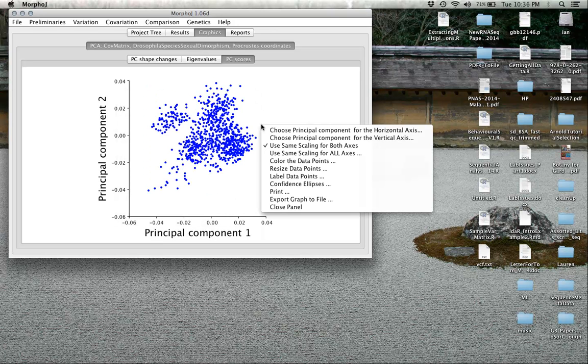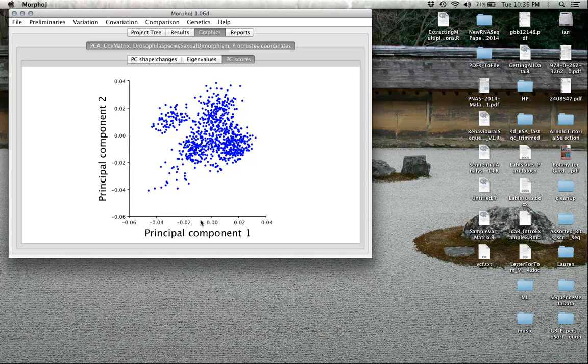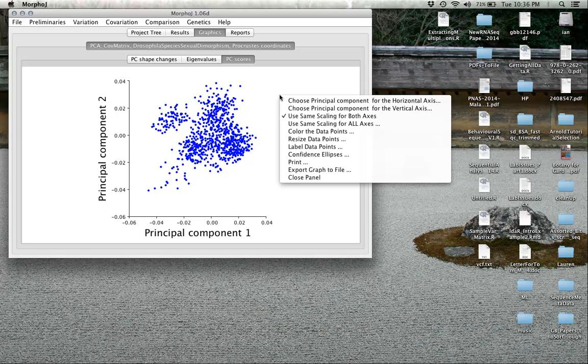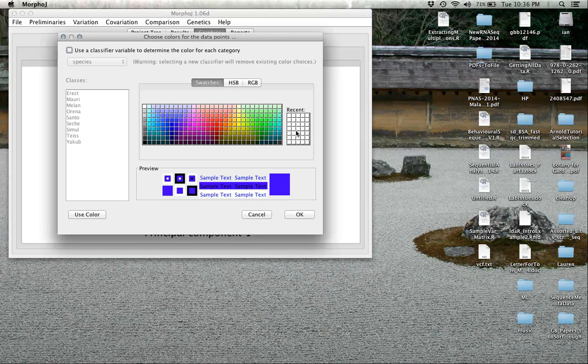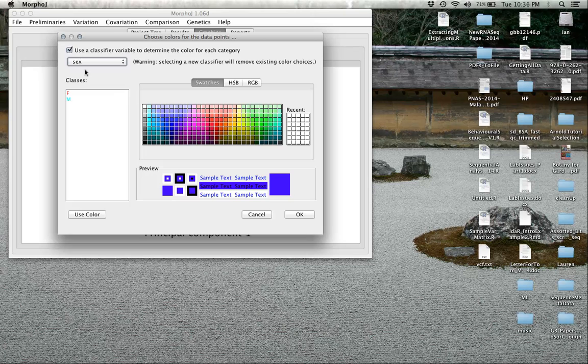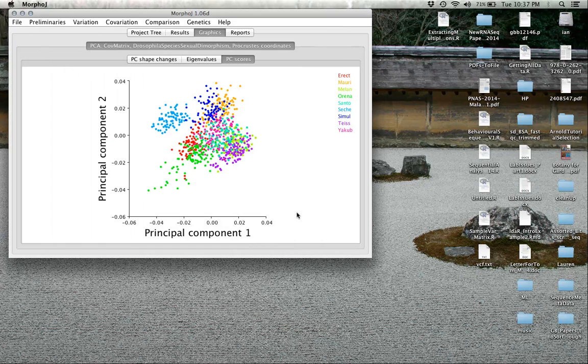The other thing we can do is color the data. Use same scaling for both axes means that when principal component one varies more, you can see that more clearly in the position of these points. We can also color the data points by things like species or sex. Let's classify by species. We should have about eight different colors, and lo and behold, we see all the individuals who are Cichelia, this light blue here, cluster together.